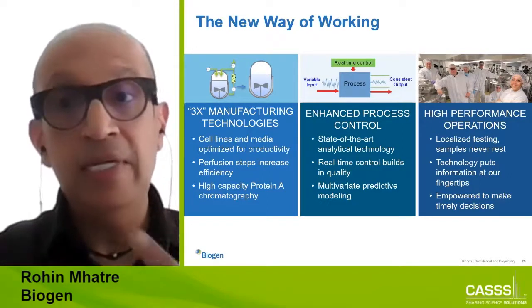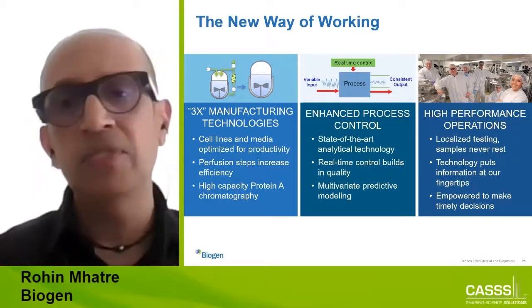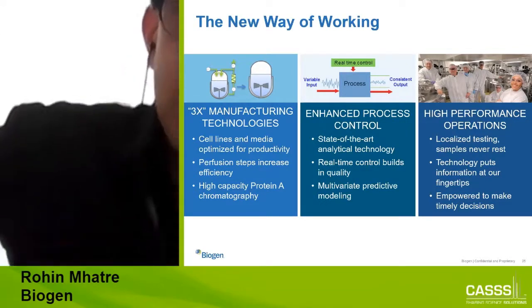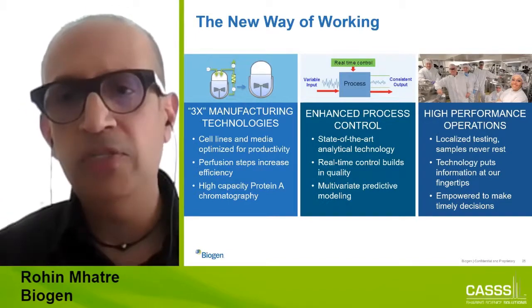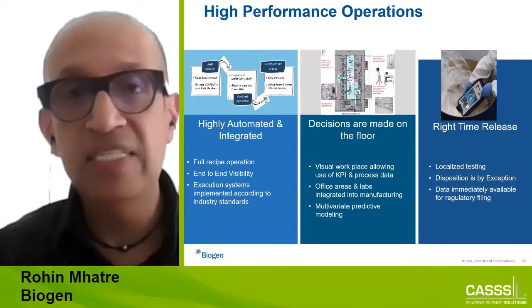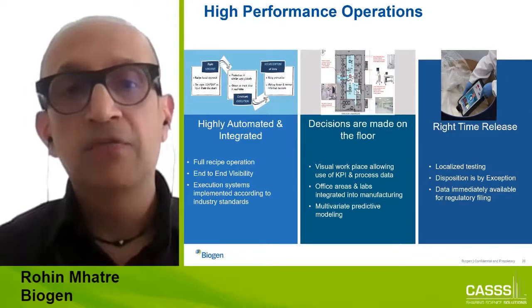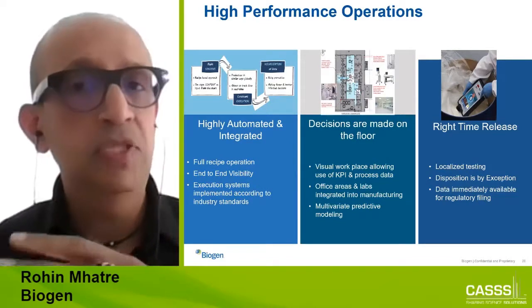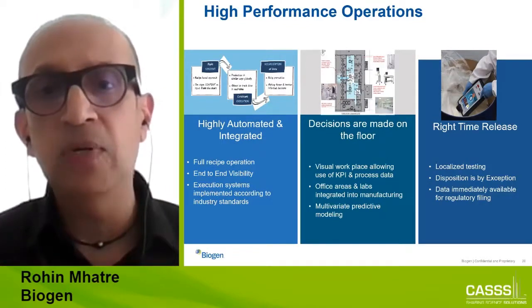And just truly high performance operation, localized testing where it's needed. You're not shipping samples all over the place, or you're not doing a production and then eventually testing 2 weeks later. All of this is done in a way to optimize the operation. And through all of that is clearly, systems need to fall in place. So we've gone into a very recipe-driven operation, facility to facility, having it as consistent as we possibly can, although there may be some differences in equipment, depending on how the facilities came about and so on.